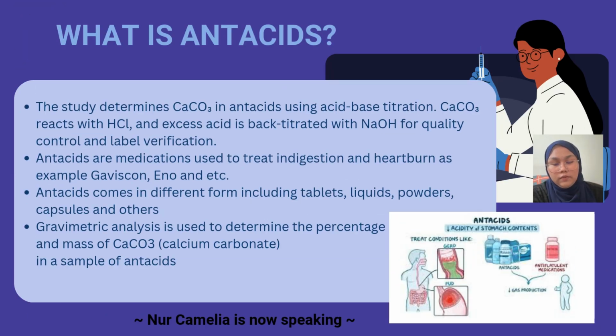So for introduction, first I'm going to explain about measuring CaCO3 in antacids using titration. Calcium carbonate in antacids reacts with hydrochloric acid. After the reaction, any leftover acid is measured using sodium hydroxide. This helps check the amount of CaCO3 in the product for quality control and accuracy.